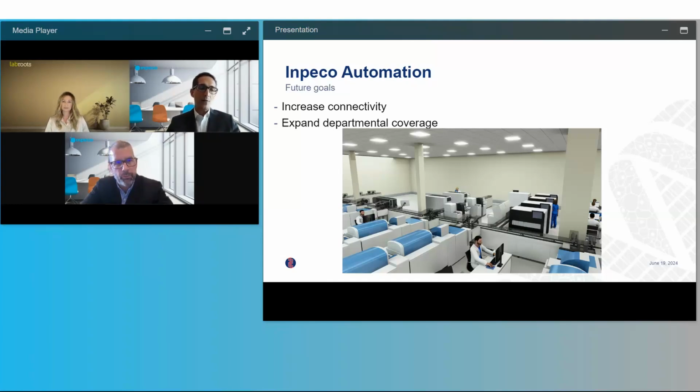In the paper that we're referring to, it's 15%, but that number is correlated to the total number of people working in the lab. If you just look at the core lab or the section that has been impacted by automation, there have been cases where the reduction is 50% or higher.